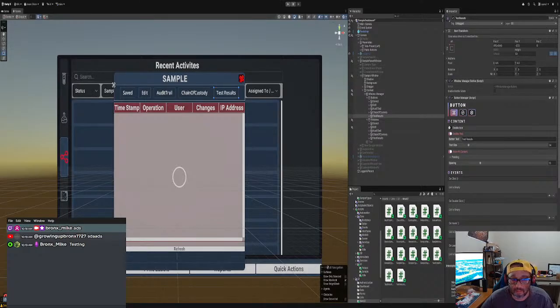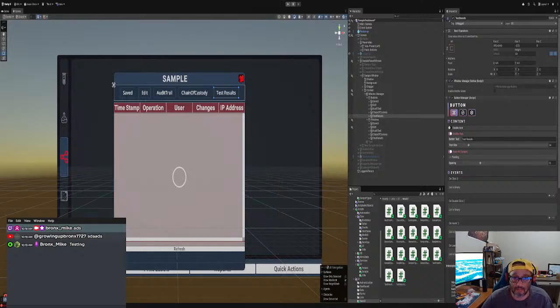And then we have another one. We have 3 more errors. We'll find it right away. Okay, we got the sample event bus. So that needs to be namespaced. Right? Save it. Then move on to the next error, which is down here, as you see. And then you just say sample name. All right. And then event bus. Again, you just got to add the namespace to it.